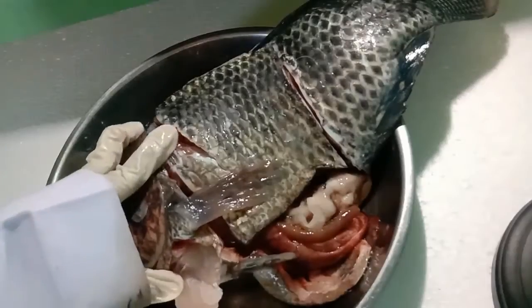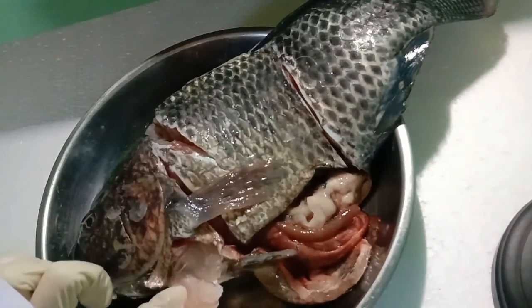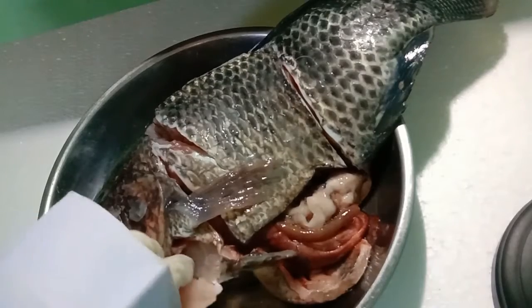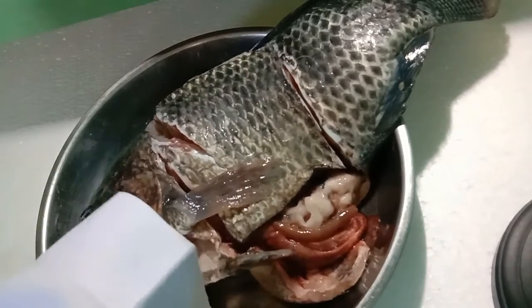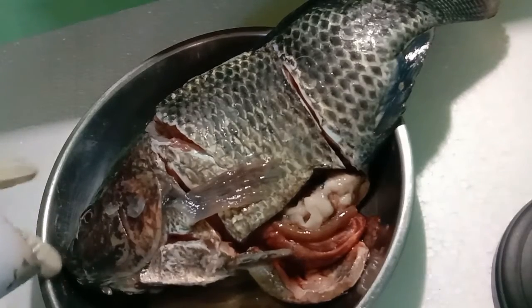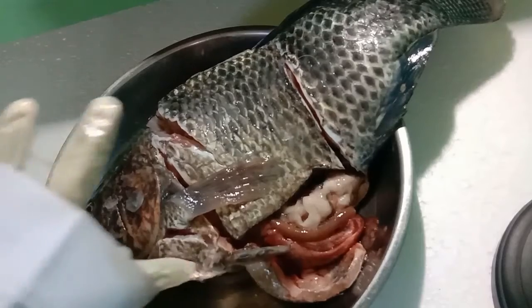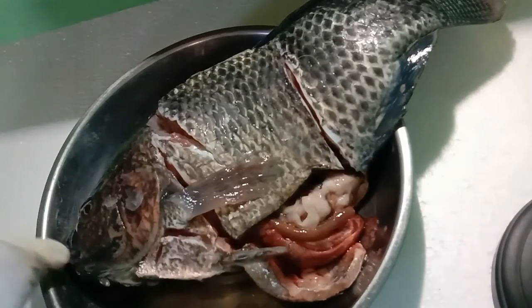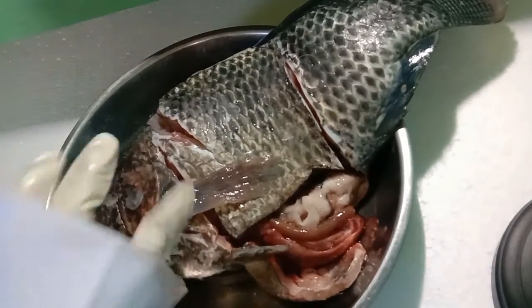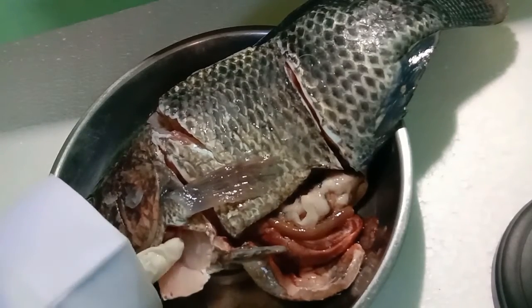So this is the sternohyoid muscle. This muscle really contributes to the overall power required for suction feeding, like opening the mouth. So the power to open the jaw is from this muscle. You can see here, this is the muscle.